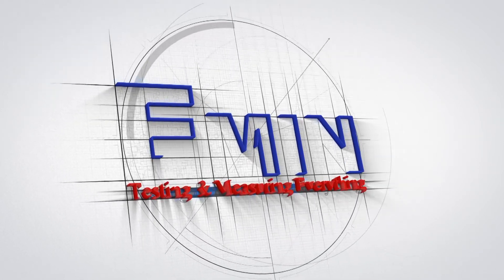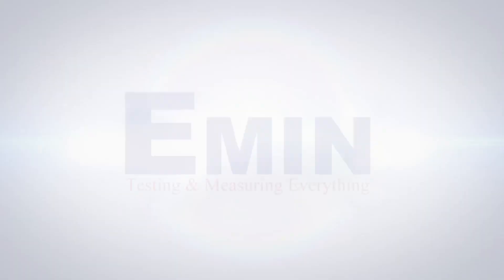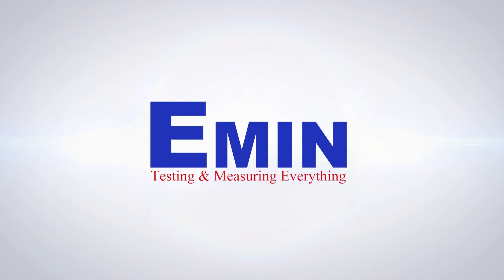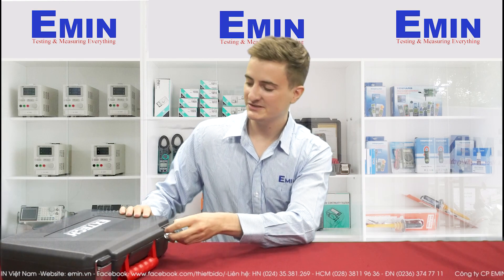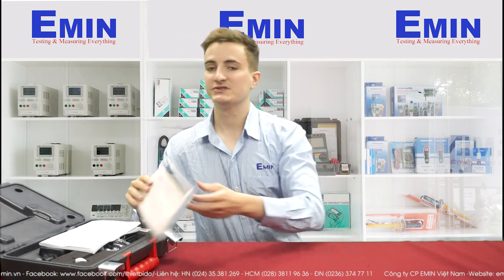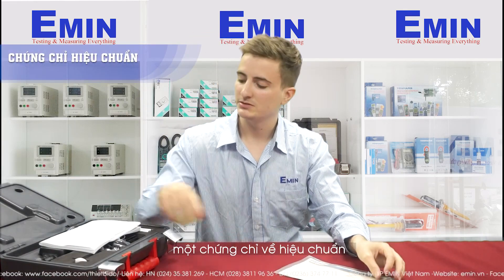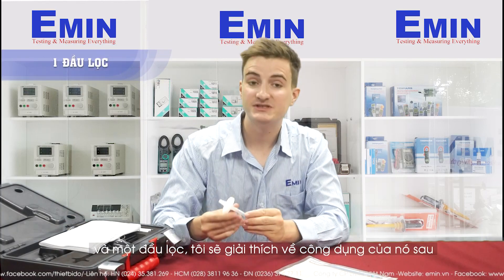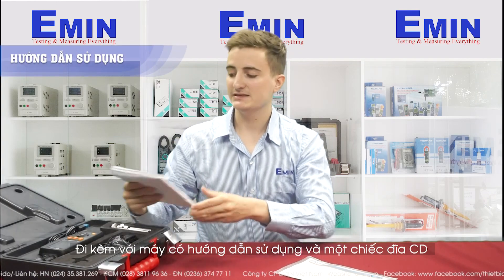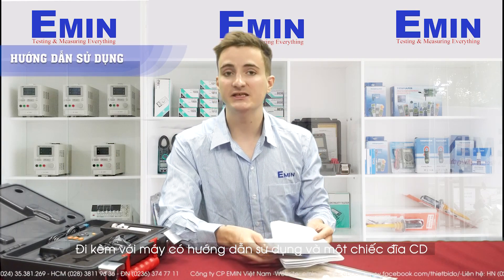Now let's start with the unboxing. It is delivered with a certificate of calibration. And very importantly, the zero count filter — I will explain later how it works. It also has the user guide with a CD.